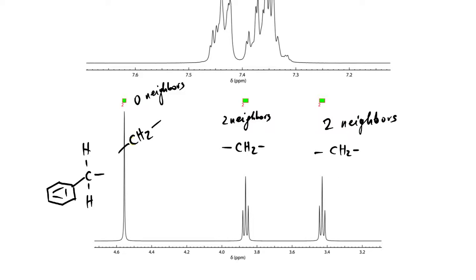What could that be? Look at the formula. Oxygen? Oxygen. Okay? Oxygen is a great separator between groups of protons, making that CH2 a singlet. How do we call this position in the ring? Benzylic.